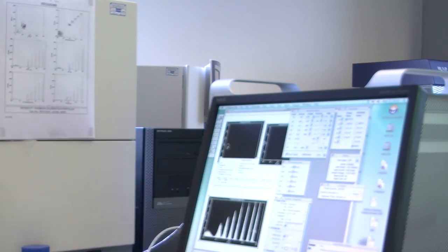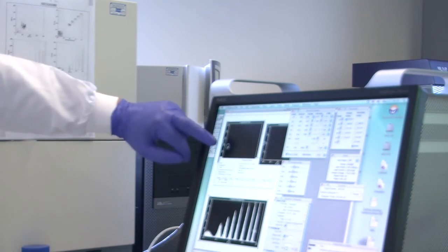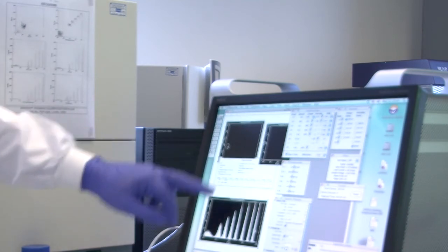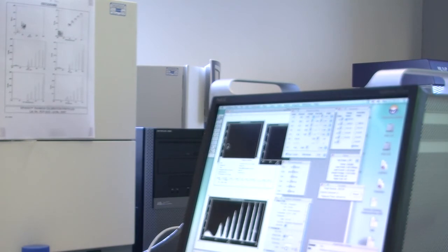So what we have to do is use the location of our peaks, and as you'll see in your protocol, there are overlay histograms, so you've got one with another one over it. I will make use of those when I prepare the data for you. But make use of the stats. We could look at the stats of this region and see what percent of everything going through our cytometer are beads. We can then say, well, what percentage of beads are in this high peak? So we can use stats that way to look at percentages, and we can then say how much fluorescence is there.